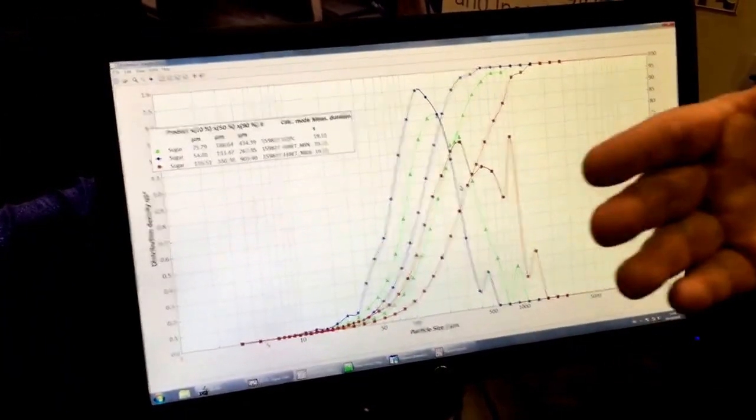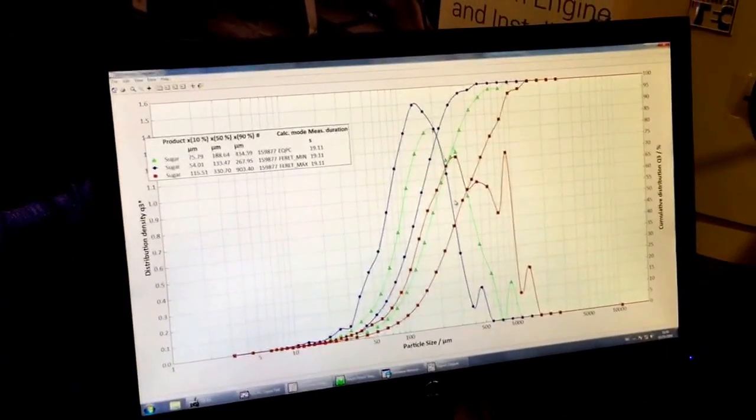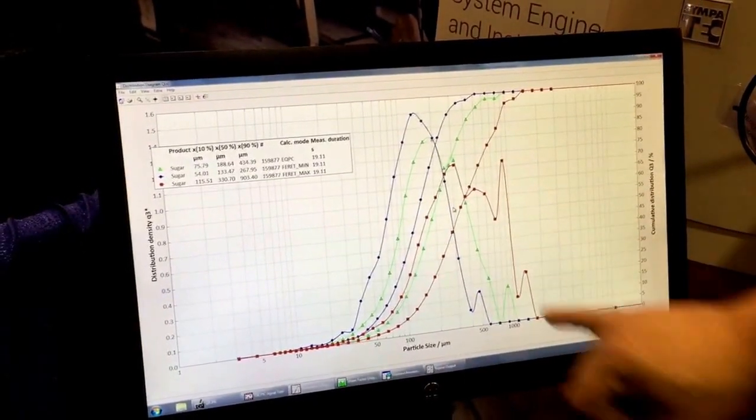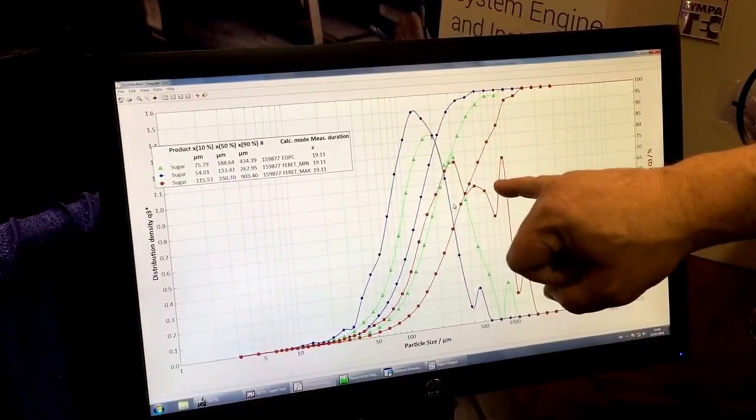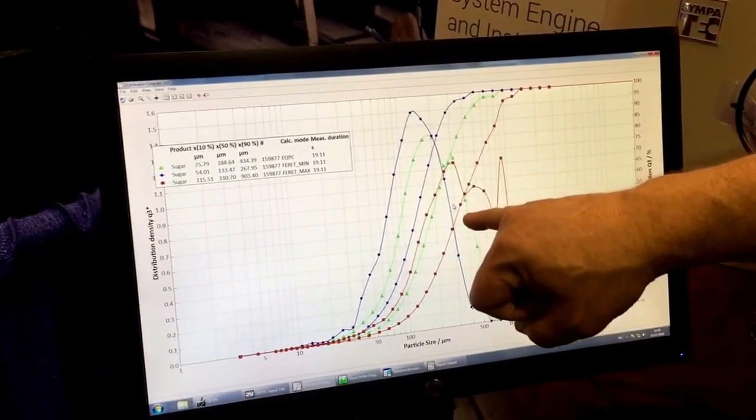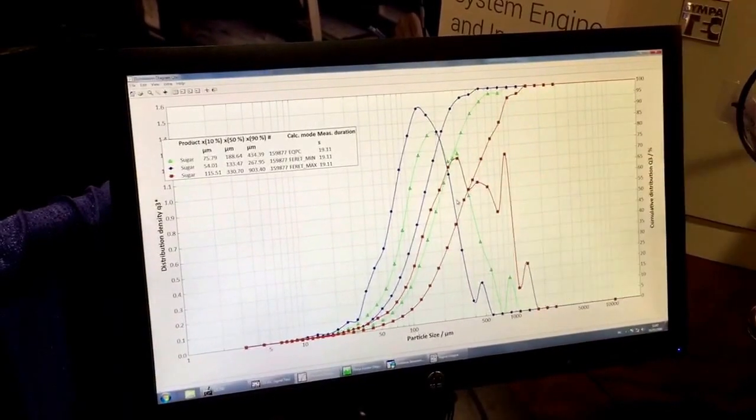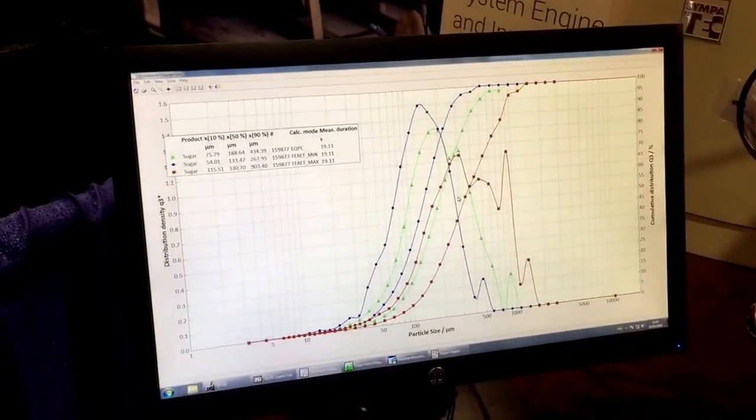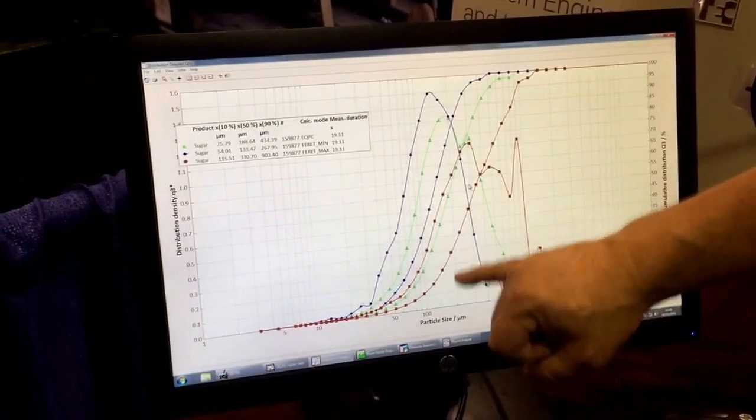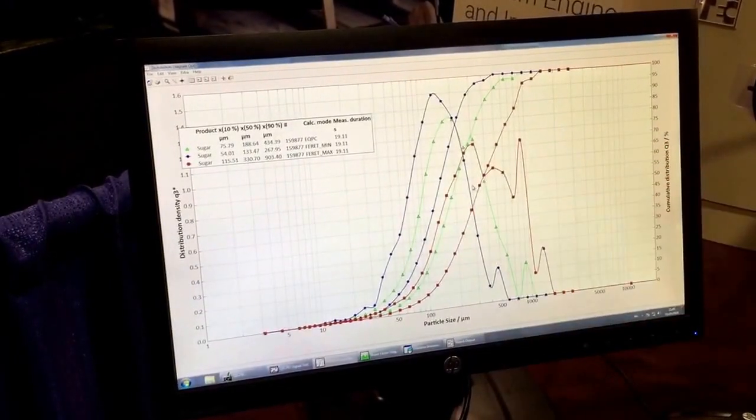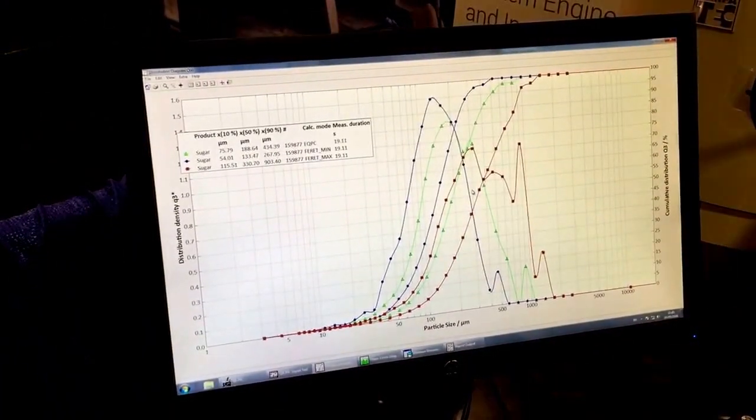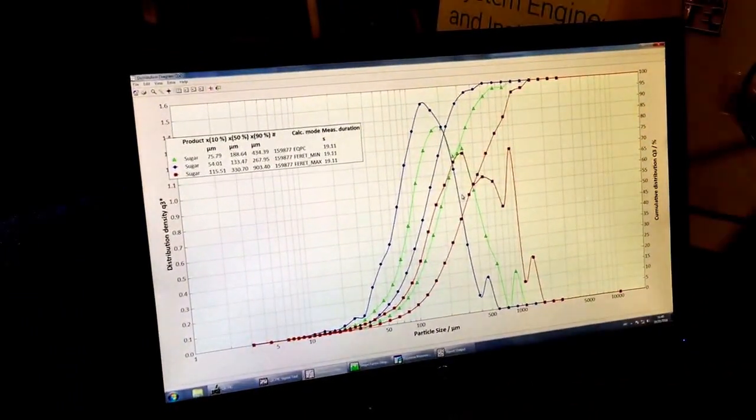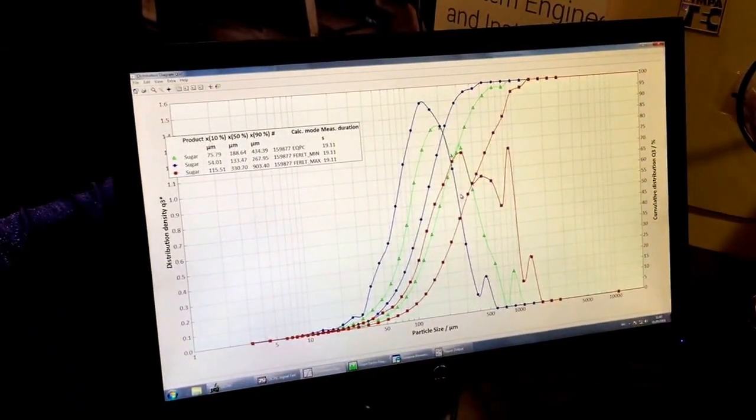And so it gives me an idea of the spread of all the particles, where the fines are, where the coarse are. Some of these guys, especially maybe having a direct impact on other characteristics like flowability, packing densities, all sorts of other material characteristics. Now remember, this is a volume-based measurement or a mass-weighted measurement.